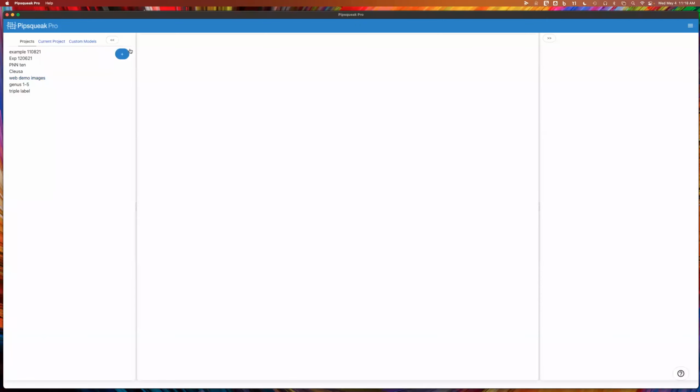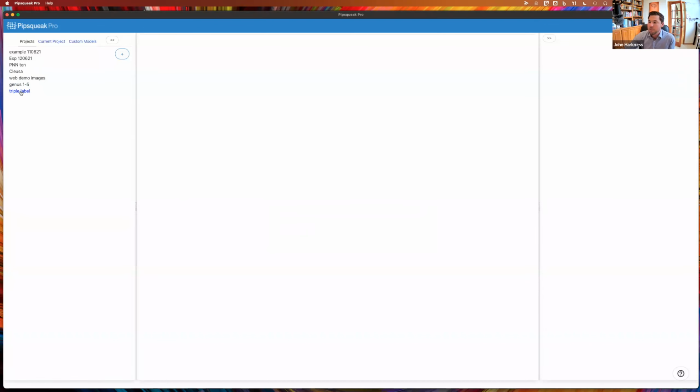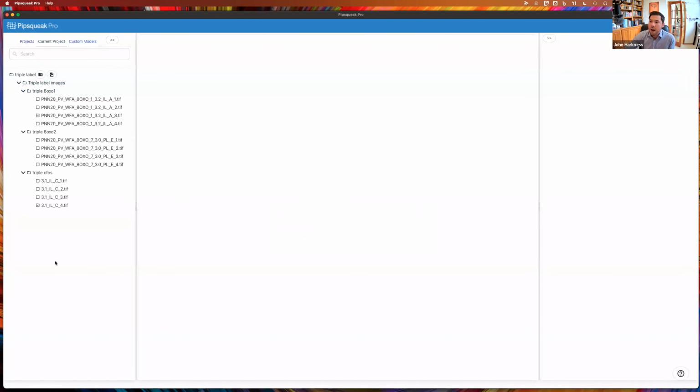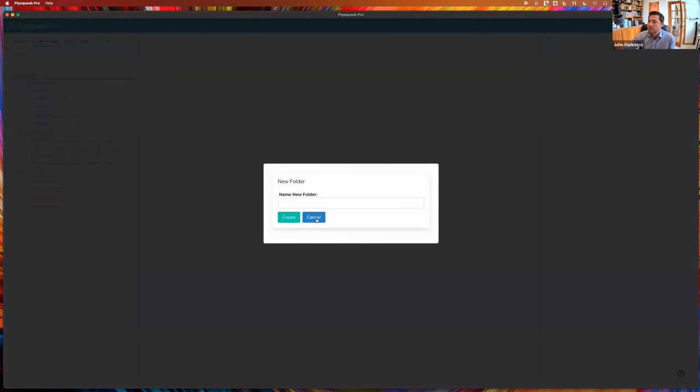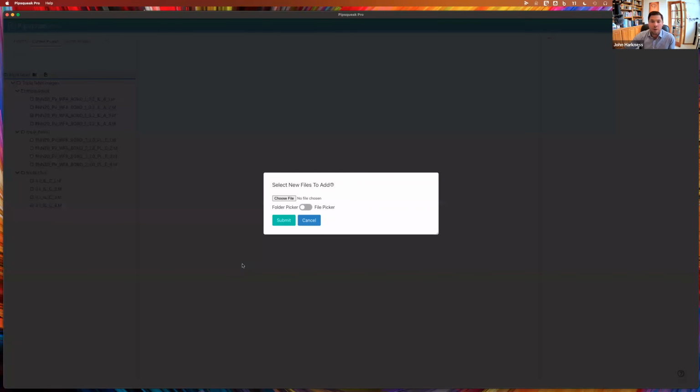And so, here I might create a new project. I already have a couple here going, so I'm just going to open this one here. But if it was a new project, the first thing that I might want to do is either create some folders for organization, I can move images around in those folders, or I might want to just upload a whole directory as is. I have a choice to either choose individual pictures or a directory.